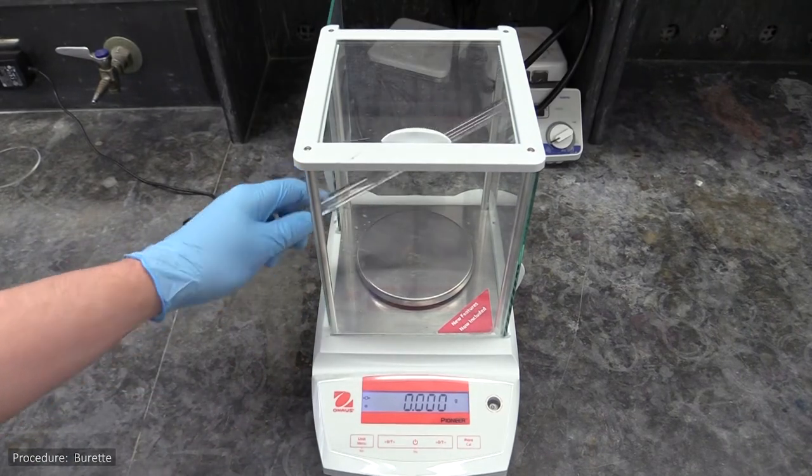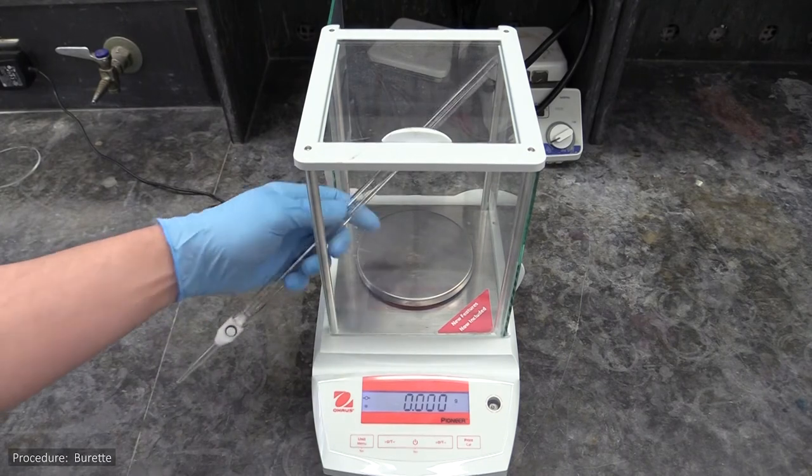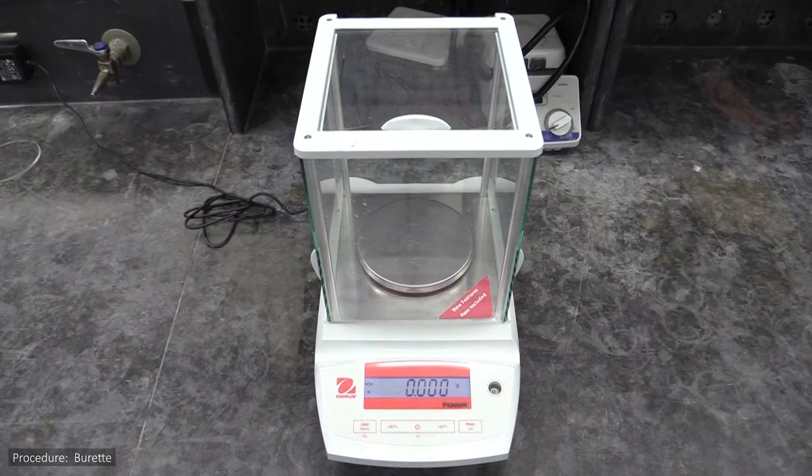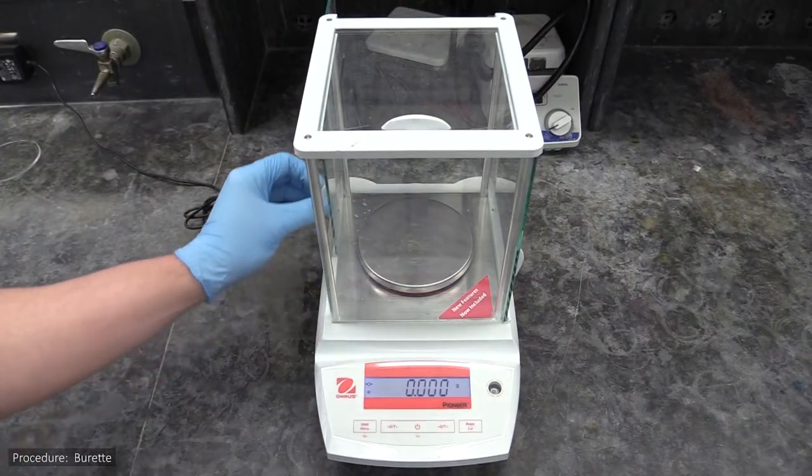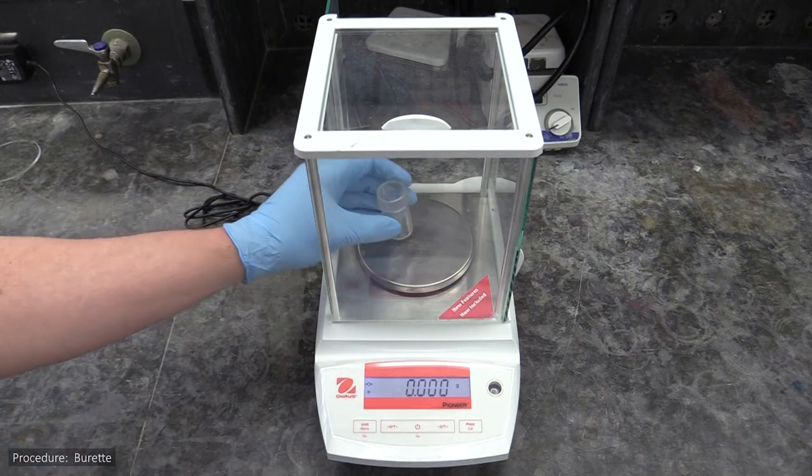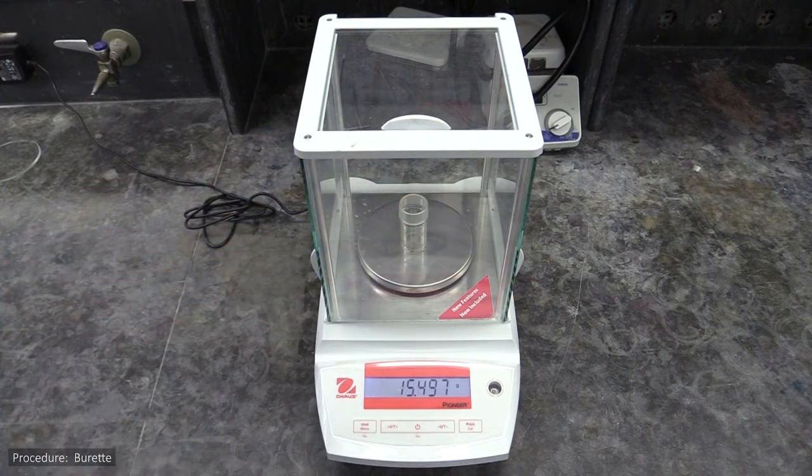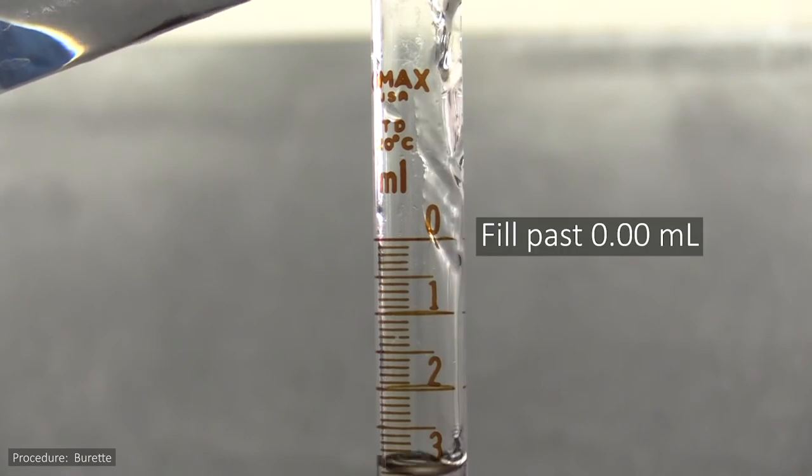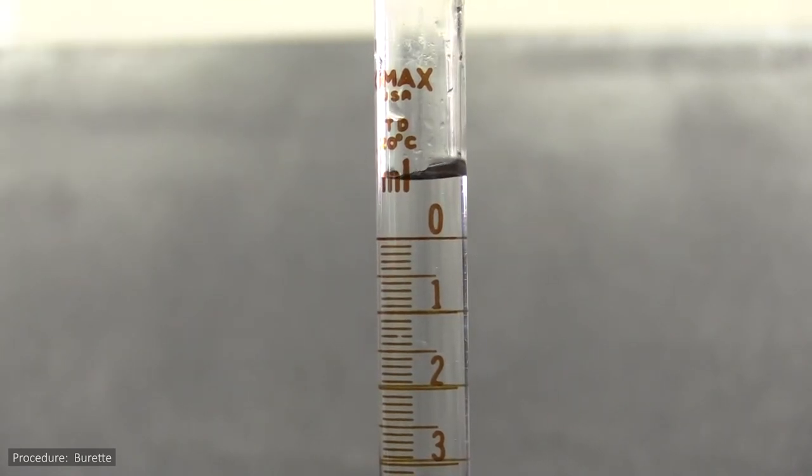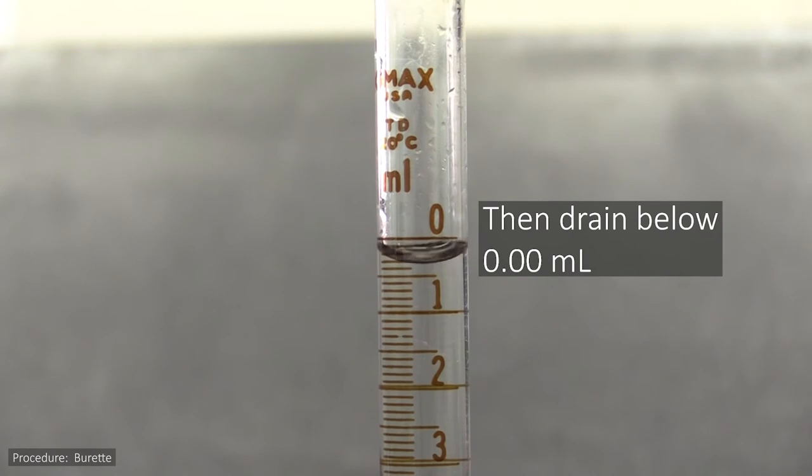Now you won't be able to put your burette or pipette right on your scale, so you'll have to do something a little different for them. To take your burette data, you'll use it to dispense water into a weighing bottle. First, weigh the bottle without any water inside. Next, fill your burette to somewhere past the 0.00 milliliter mark and drain a little of the water out, enough to get it below the 0.00 milliliter mark.